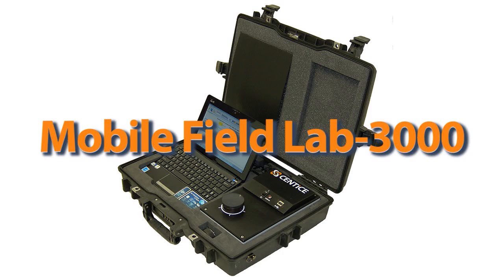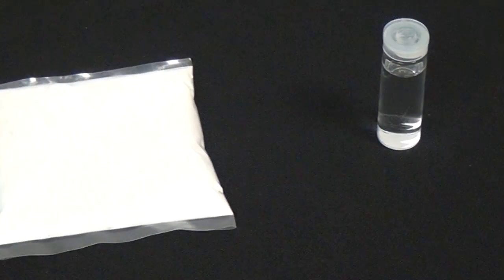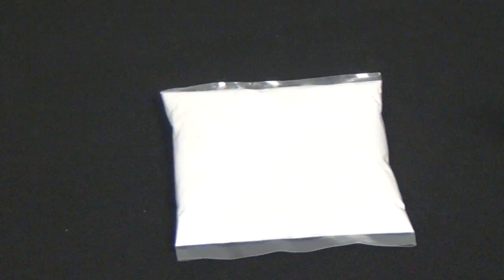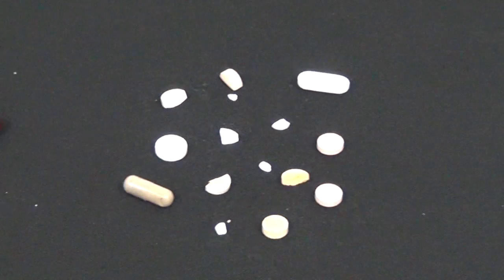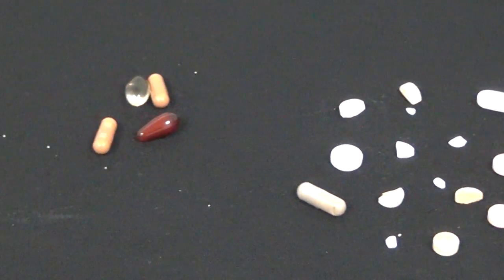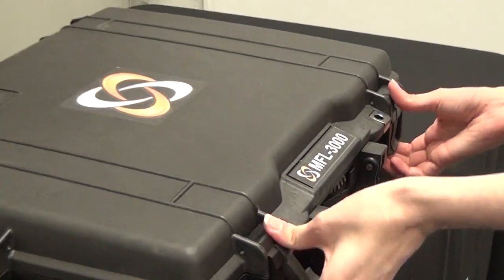The Mobile Field Lab 3000 from Centice Corporation chemically identifies liquids, powders, and pills using the confirmatory science of Raman spectroscopy.